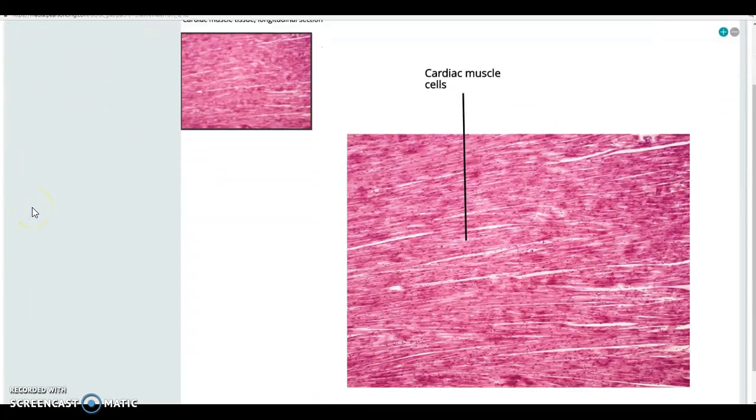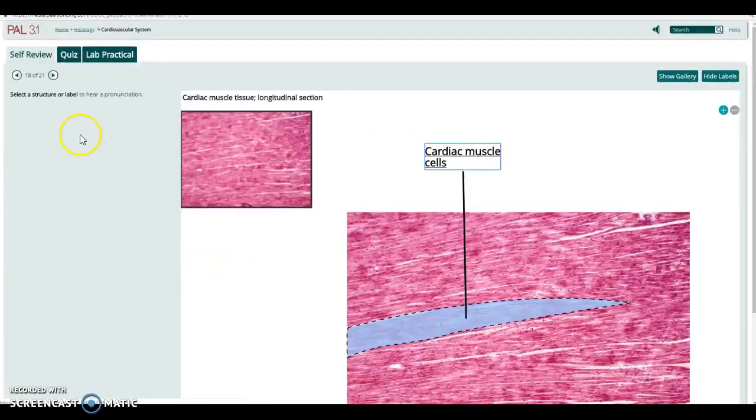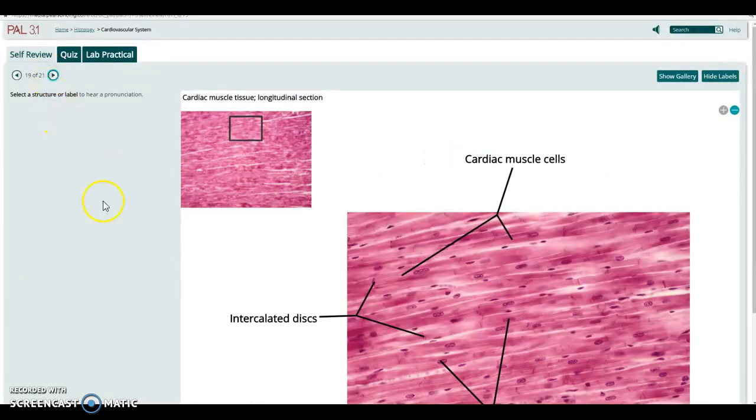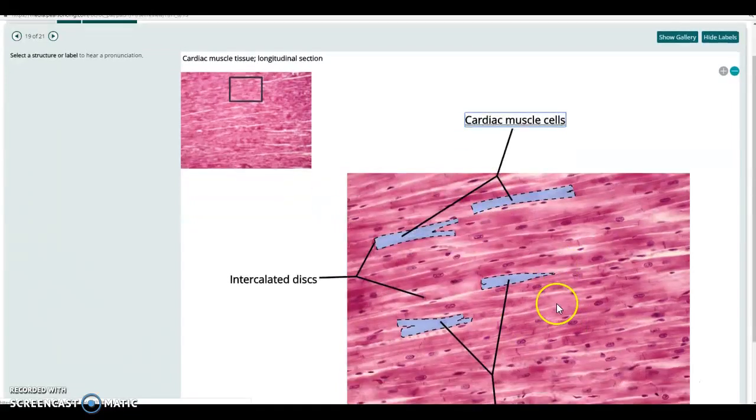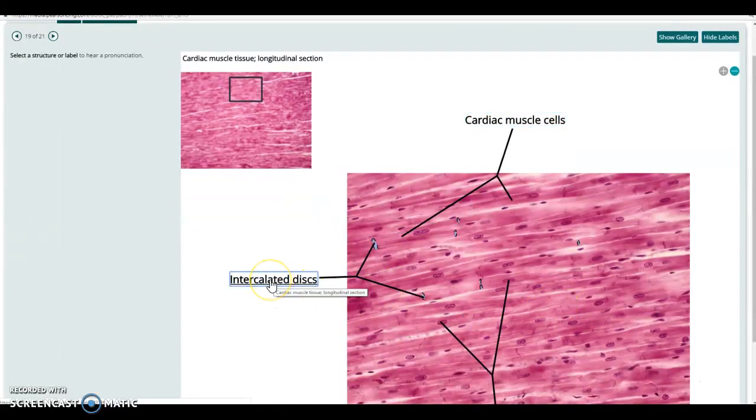This is a cardiac muscle cell now and this is very low power. You can see all the cells on here, you can kind of already tell they're striated. When you see up close, you can see the striations in the cells, individual cells and those intercalated discs, you can see them all over the slide, those little dark connectors between the cells that allow the action potentials to run from one cell to the other.